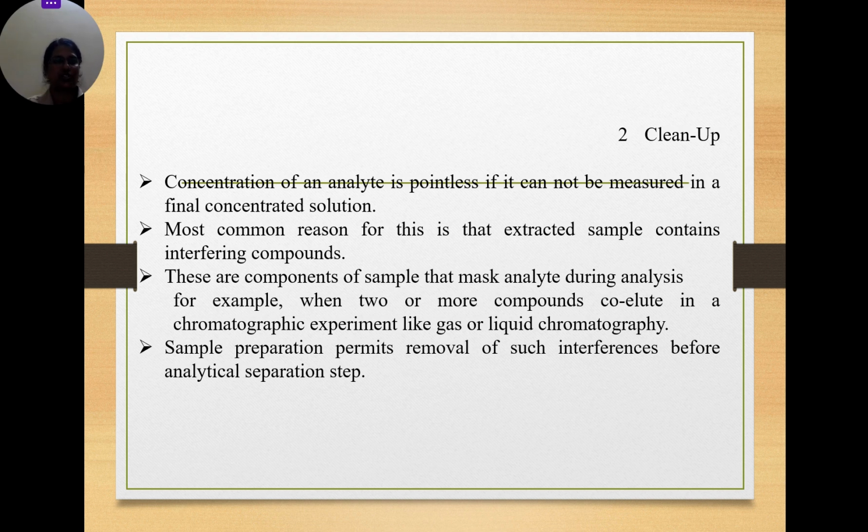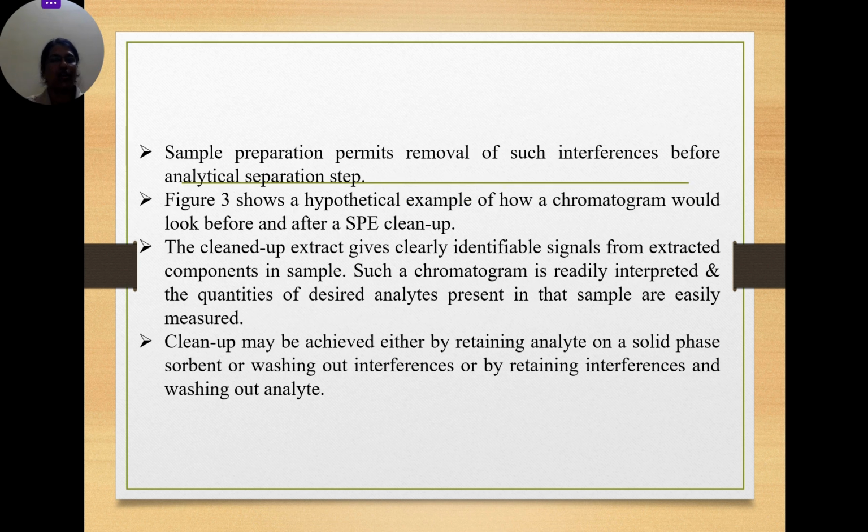So that's why we are washing repeatedly, and we are collecting these matrices and identifying them. So sample preparation helps us to remove such interferences before our analytical step. So cleanup is very important, which is our second goal or objective.